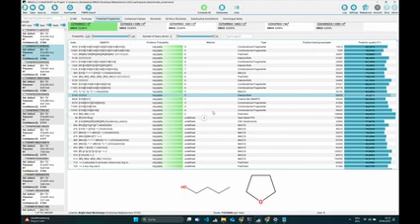Markus, can you comment on ZODIAC? In general, I would assume that it just works, because the idea of ZODIAC is that if you have related compounds in there, it should also work between positive and negative mode, because if you have a metabolomic sample, then these compounds should be related.